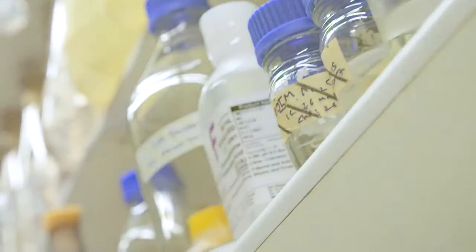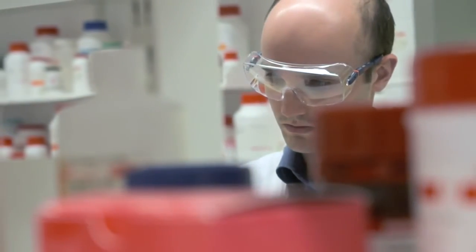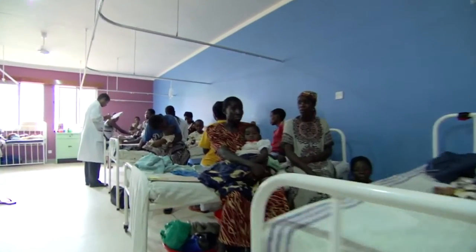RPA stands for Recombinase Polymerase Amplification, and it's an isothermal alternative to the polymerase chain reaction, or PCR. Due to its isothermal nature, it can be taken out of the lab and put into unusual locations and into the hands of people who are not molecular biologists.